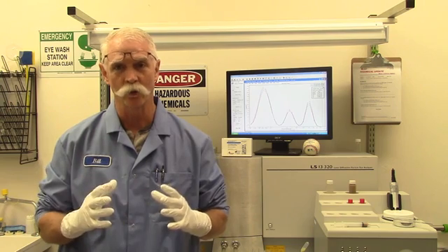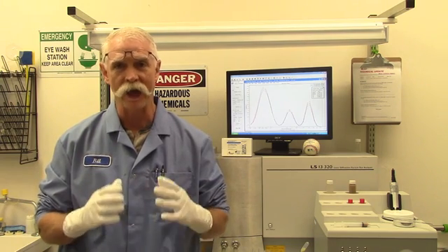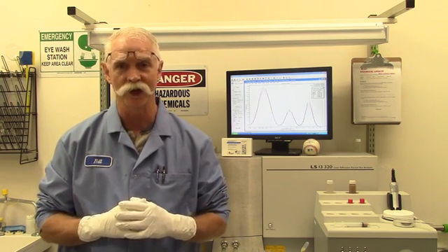Remember, sample preparation is really all about particle separation or dispersion. To get the particles away from one another so you can get a good, accurate measurement and a good representation of the overall particle size distribution.